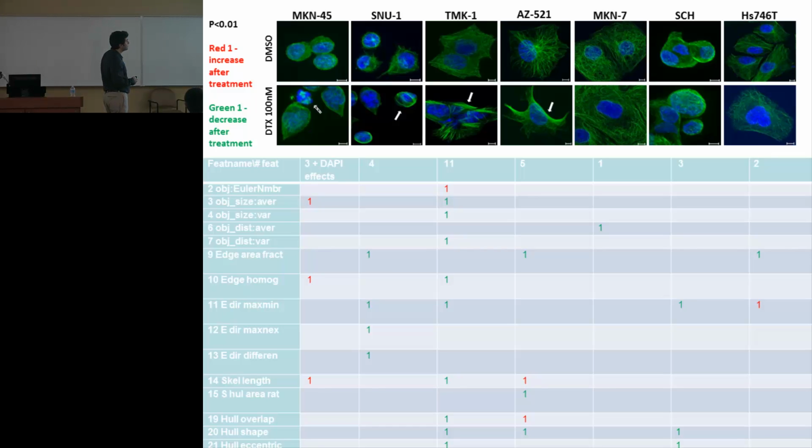So, given these images, then what? You want to segment them, and then find some properties of each connected region? What I want is an automated readout of whether a cell is affected or not. Any representation of the green area of the cell in this image would be a good readout.